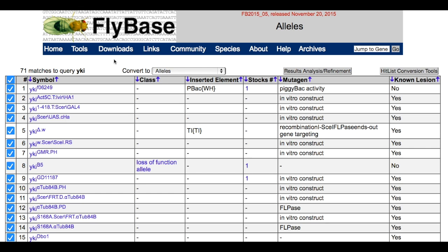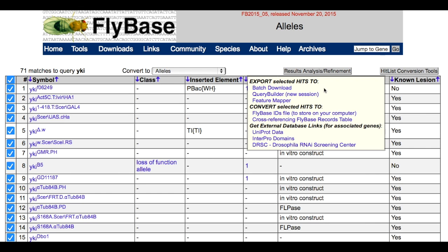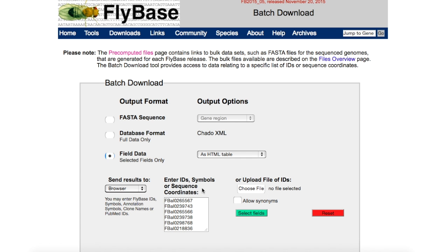Once you have selected the alleles you want, click on the hit list conversion tool button to export the selected hits to our batch download tool. This will open a new page. The FlyBase IDs of your selected alleles have been entered automatically into the input box.